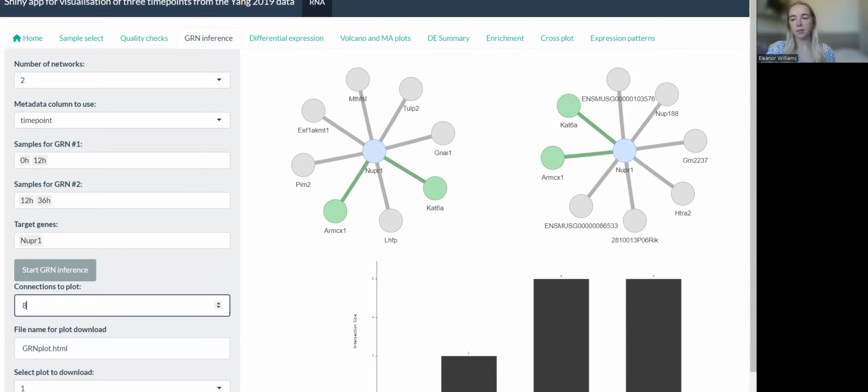From there, there's a host of ways to enhance the GRN inference within Bulk Analyzer. Firstly, by adding enriched terms from the gene set enrichment analysis that are associated with multiple genes in the GRN, and by adding custom external annotations. You can integrate multiple modalities through cis-regulatory interactions, such as integrating ChIP-seq and RNA-seq data, and trans-regulatory interactions, like combining messenger RNA-seq and microRNA data. By integrating multiple modalities, you can create a combined network to enhance understanding of how your whole dataset fits together.